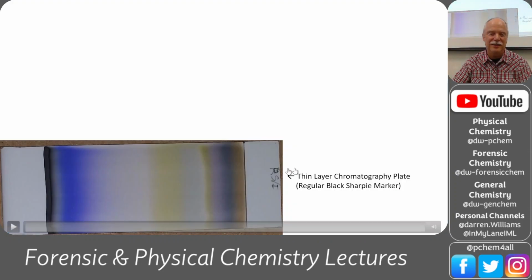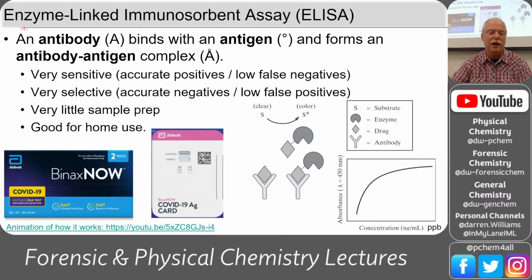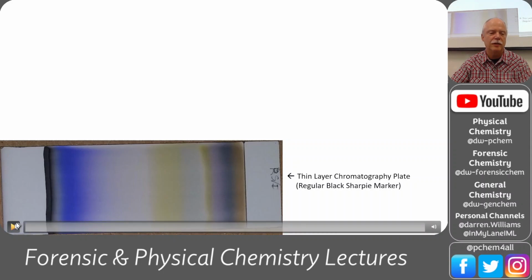Another neat setup. Anyway, we worked hard on that. So here's a neat one. This is chromatography, but the data you get on chromatography looks like a chromatogram. So if you were to turn this into a chromatogram, this is what we would have.